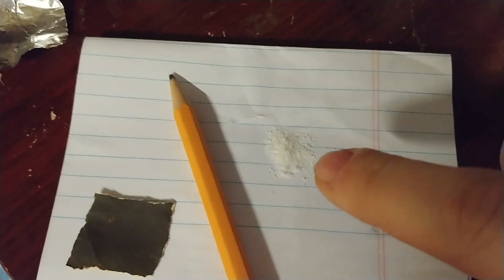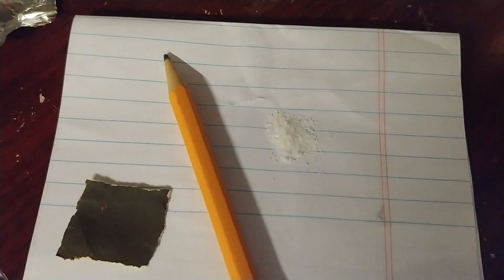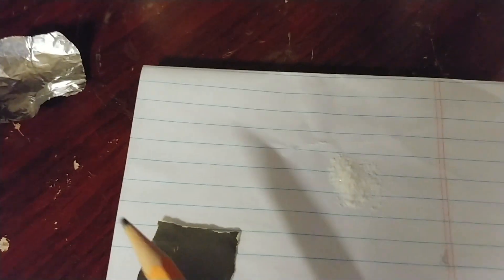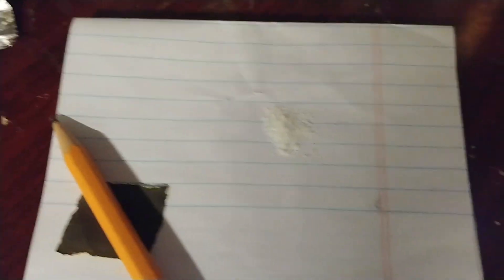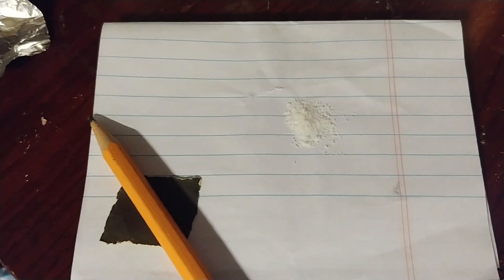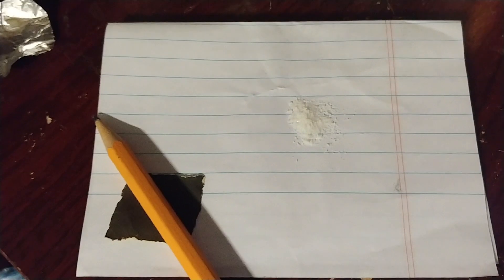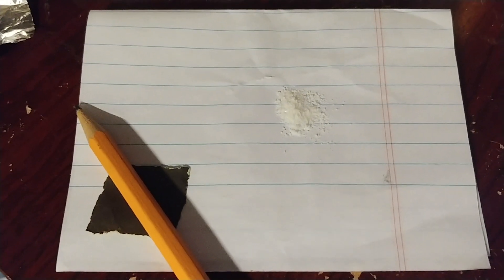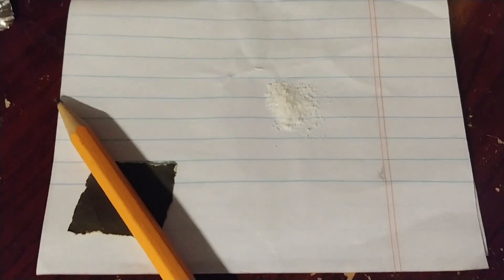What happened the other day was I made this accidental byproduct, and you can see just how very little is here. It's a very tiny amount - probably about the same amount of substance you'd see in a little salt packet from McDonald's. I've got a pencil here for size comparison. I had the iron oxide sitting in acetone because I wanted it to dry faster, and I thought I'd try to oxidize it further in the acetone so I wouldn't have to put it back in water and wait.